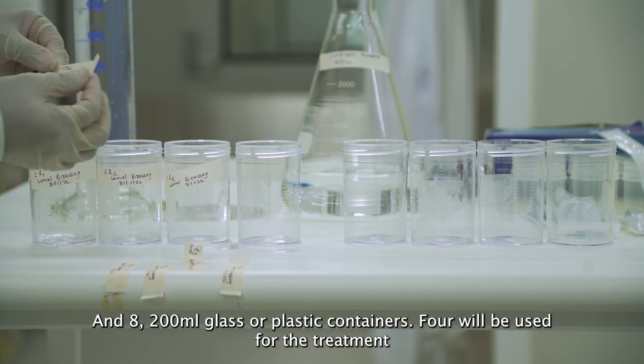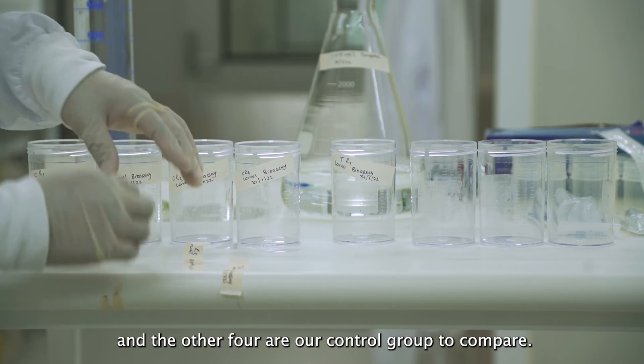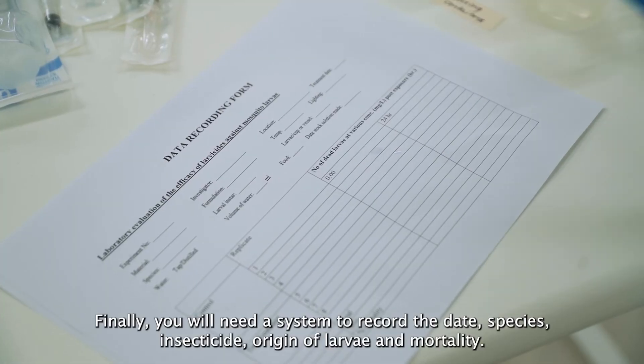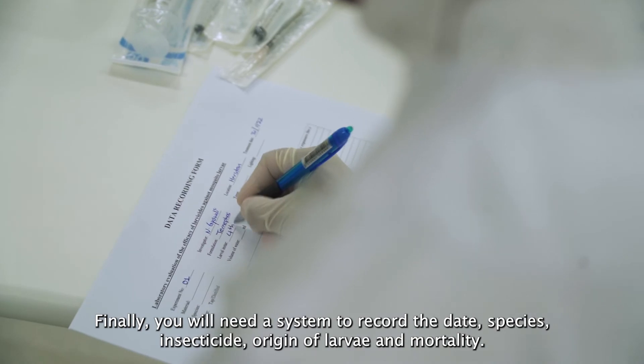And eight 200 ml glass or plastic containers — four will be used for the treatment and the other four are our control group to compare. Finally, you will need a system to record the date, species, insecticide, origin of larvae, and mortality.